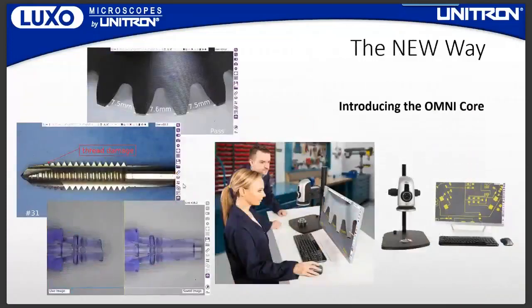There is a new alternative to the traditional microscope. The Omni Core redefines observation and inspection with capabilities and features that can be used across a wide range of applications and industries. It comes pre-calibrated to an ISO standard right from the factory, and it solves the whole ergonomics issue associated with traditional stereo microscopes. So let's take a little bit closer look at the Omni.